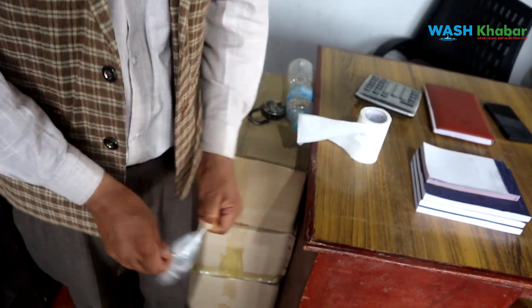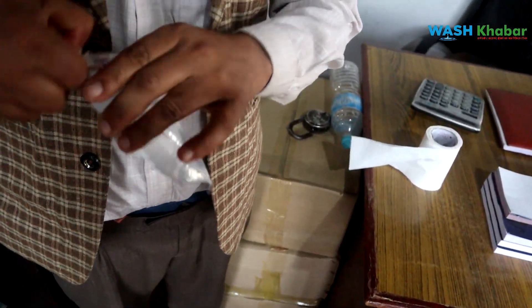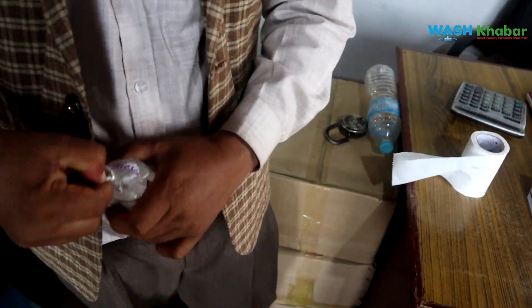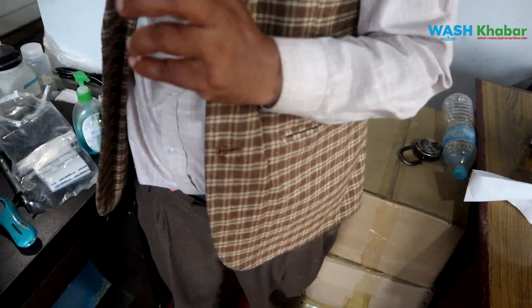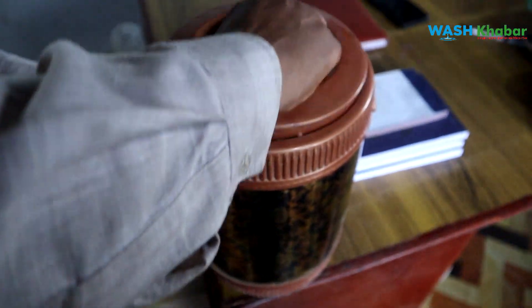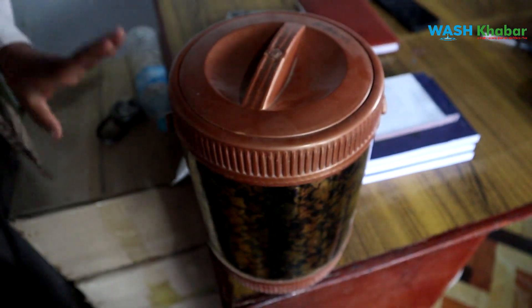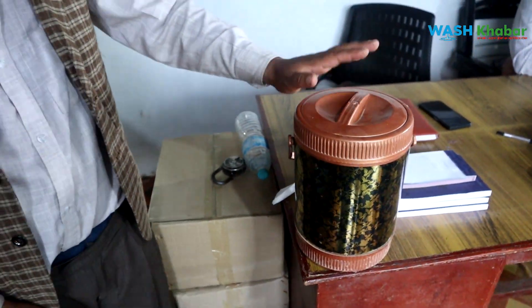This is the first machine. How do you get the water? I'm not sure what you get the water. I got the water for you. I'm not sure what the water is. You're getting the water, even if you get water. I put these two-dimensional materials in the same way. These are all the RBT.